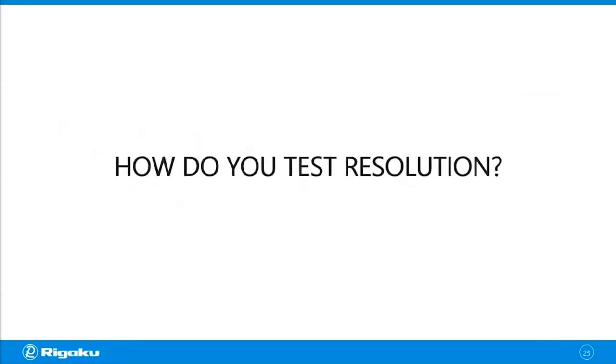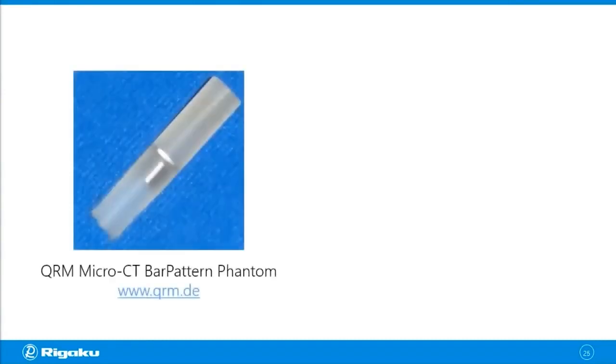But how do you test this resolution? So there are tools you can use to do this. This one is called Micro CT Bar Pattern Phantom by QRM. And it's just a little piece, probably about an inch in size.